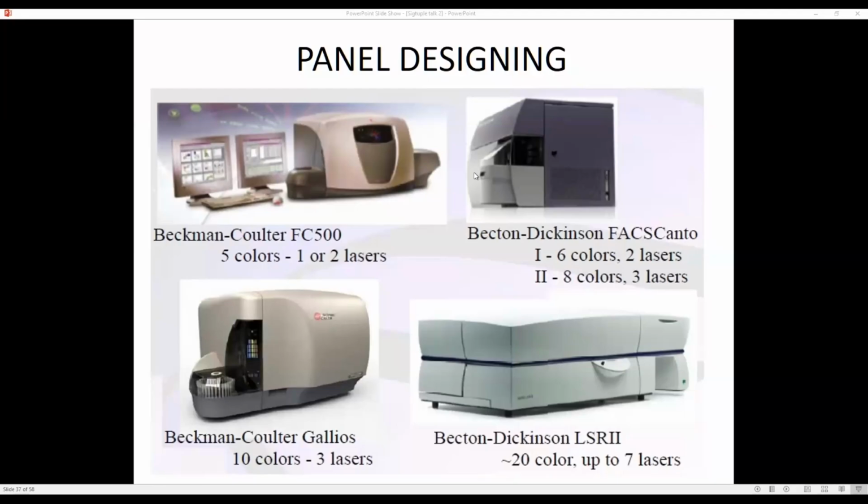So for example, if you are spending too much time on post-acquisition compensation, then you need to do your compensation exercise, as simple as that. If it's just a small adjustment here and there, then it's fine if it's not affecting our time much. There is no specific level to say you need to do a compensation exercise, but if it's taking a lot of time to set your data before analysis by doing post-acquisition compensation, you definitely need to consider doing a single stain control exercise to keep your compensation matrix correct.